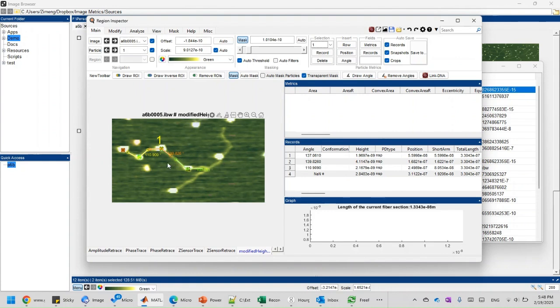Before I go to measure the secondary molecule, I have one last task to do, which is to add this protein-DNA complex into another particle set. I'll explain what that means in more detail in another video, but I'm going to go briefly over what it does here. Let's go check my website for what it does.